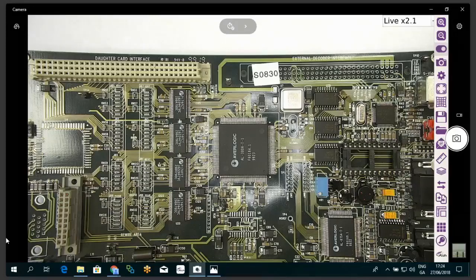So that sums up the apps on the system. That's an overview of the power of the Omni. So I can hand it back to you there, Mark.